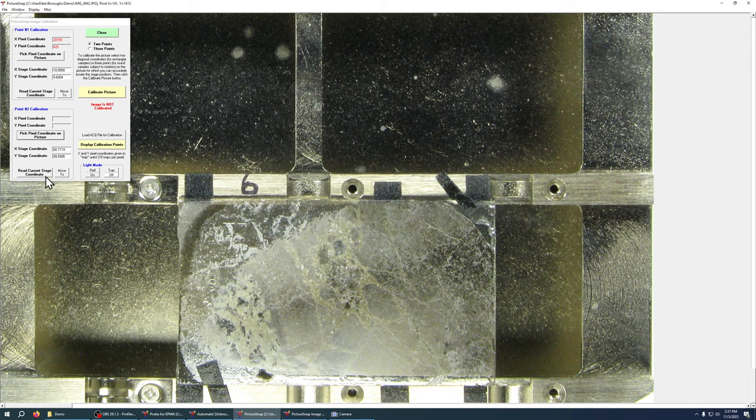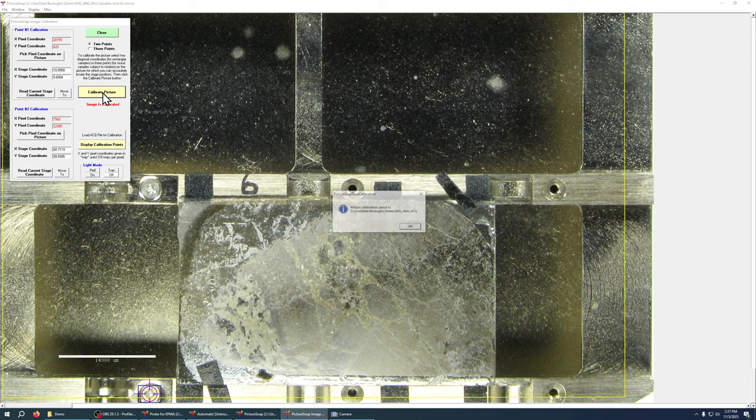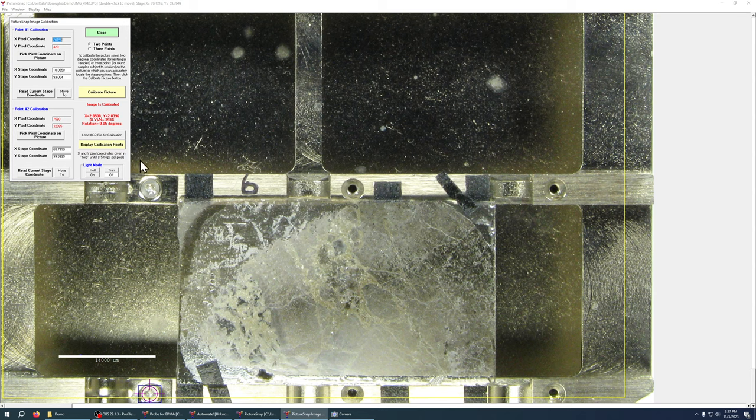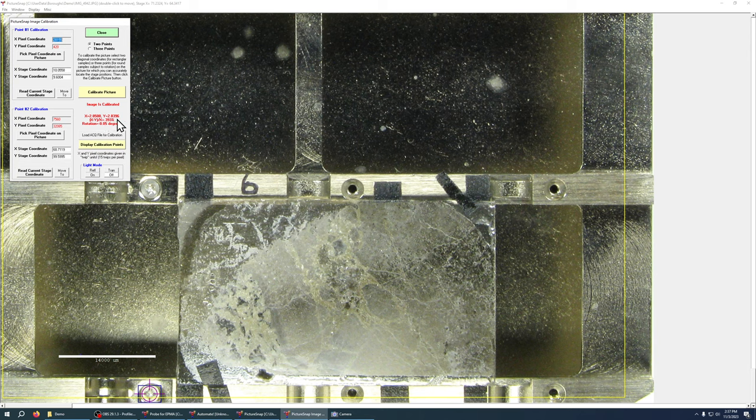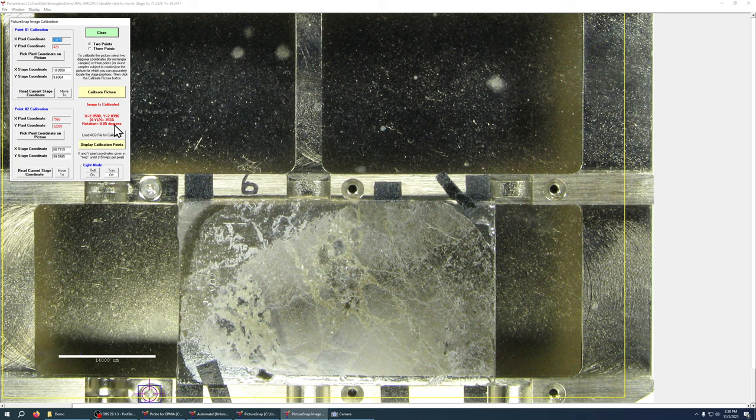And now you just hit calibrate picture and it saves that calibration file and notice there's a little bit of information here where we can actually get an idea of how well our calibration did and this is a measurement of the image distortion and this is the measurement of the rotation. I like to keep this below a percent or two and same with rotation below a degree or two. I like to get it as precise as possible.